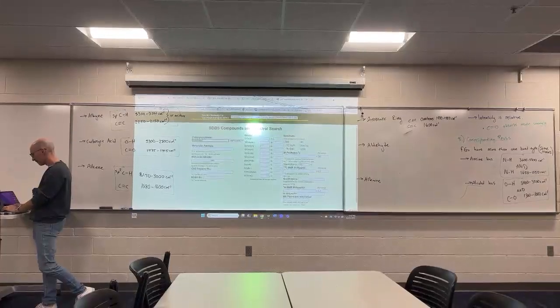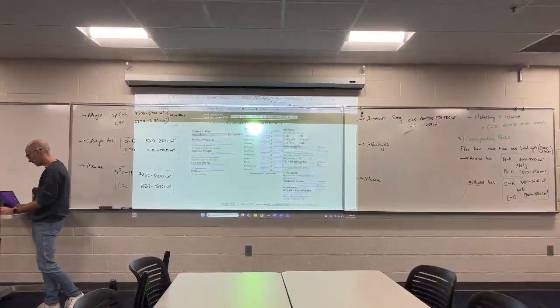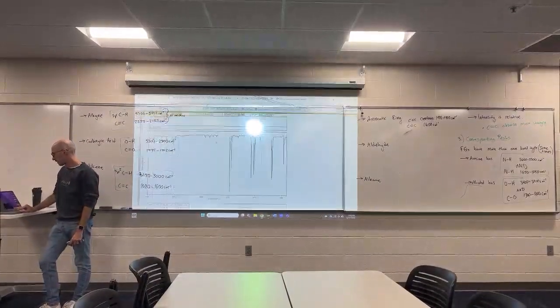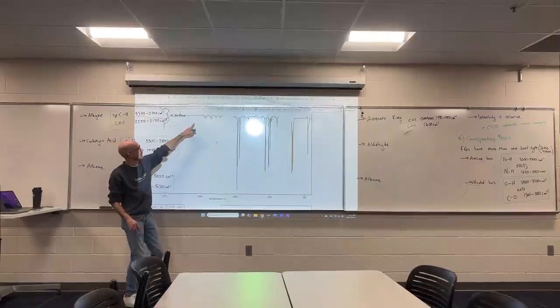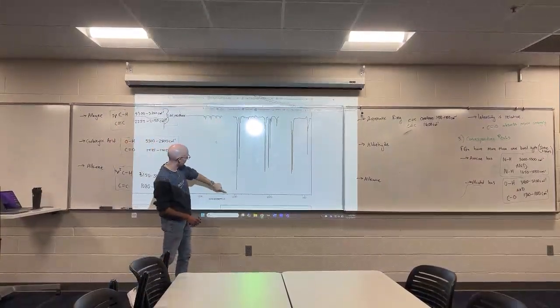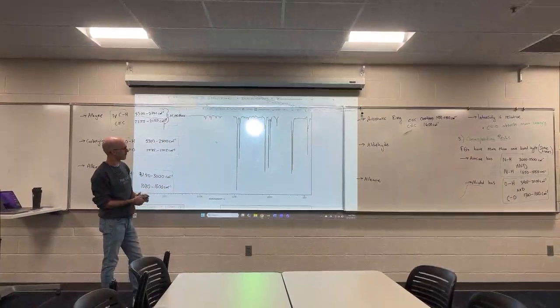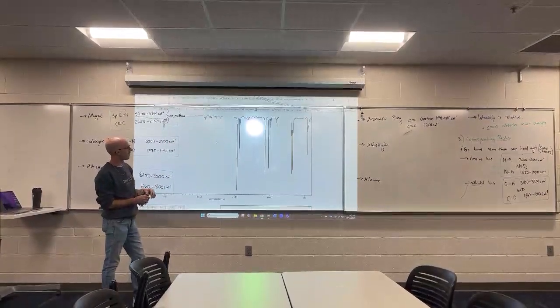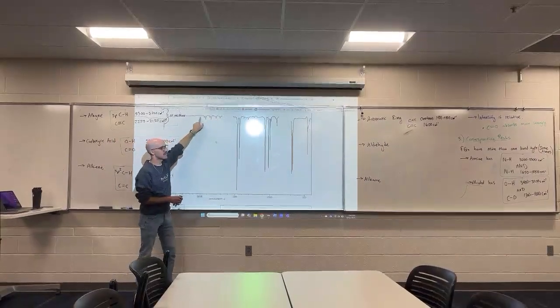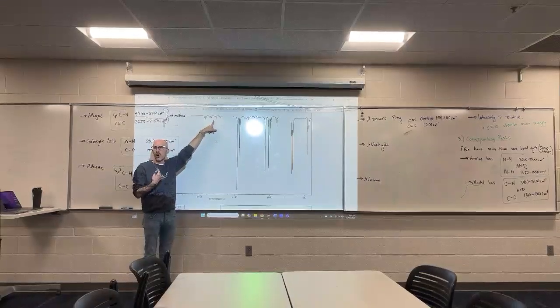Let's look at this compound, bromobenzene. Here we see the overtones. So 1600, oh, what a shame. I don't know what happened to this experimental data, but it seems to be missing its CC double bond absorption. But then we see these several regularly repeating small signals.